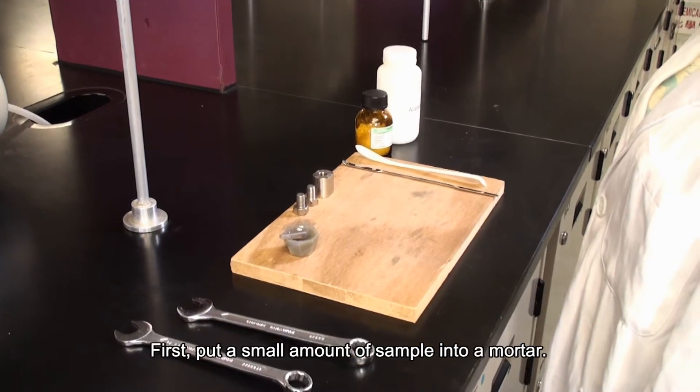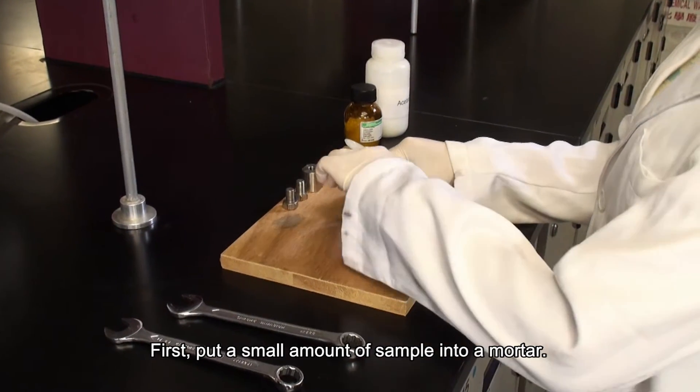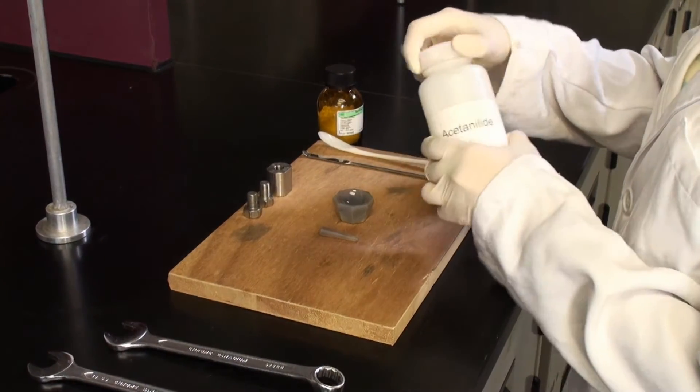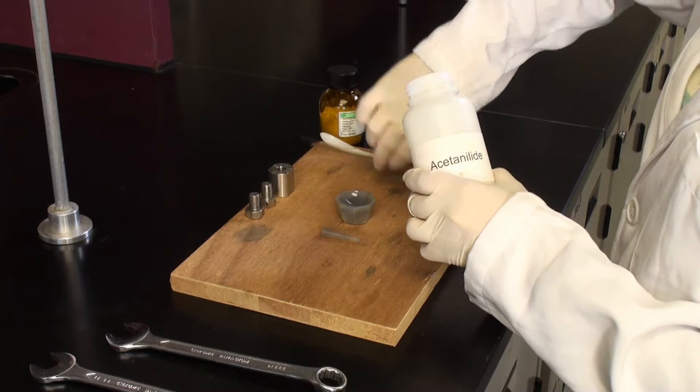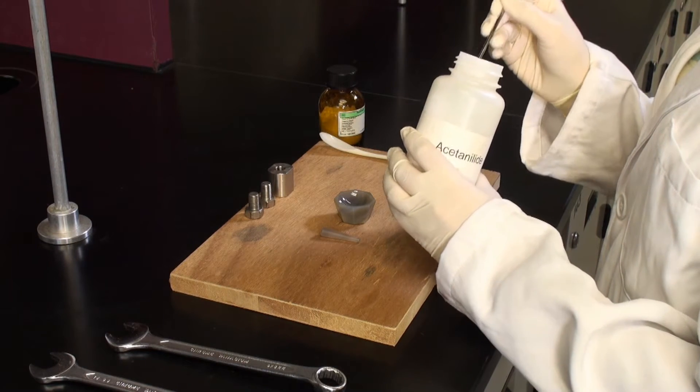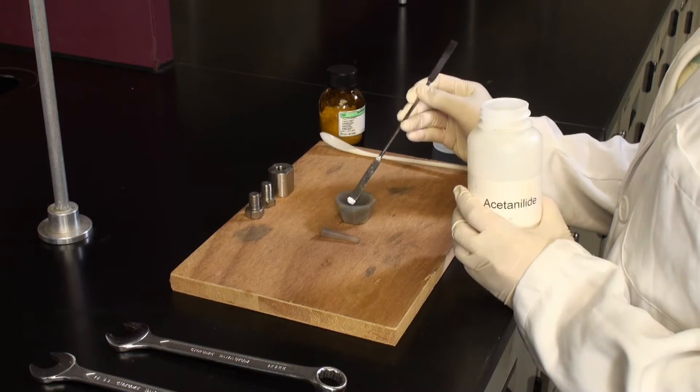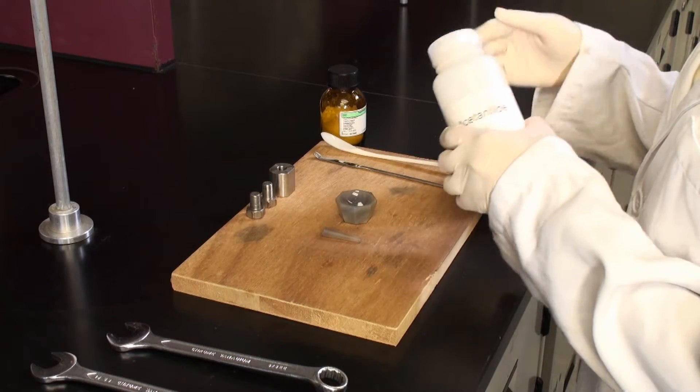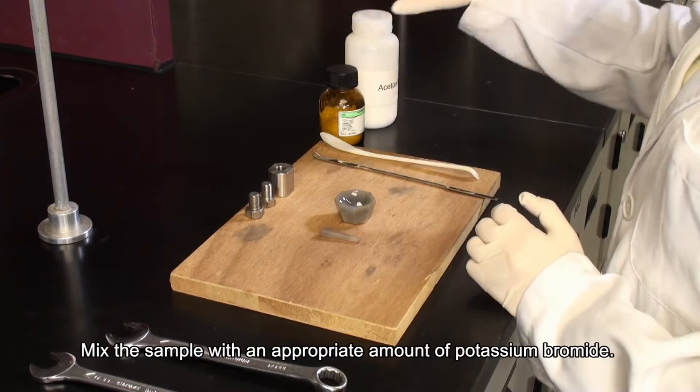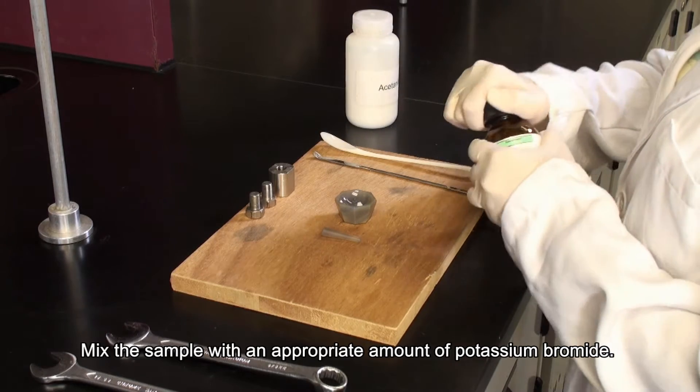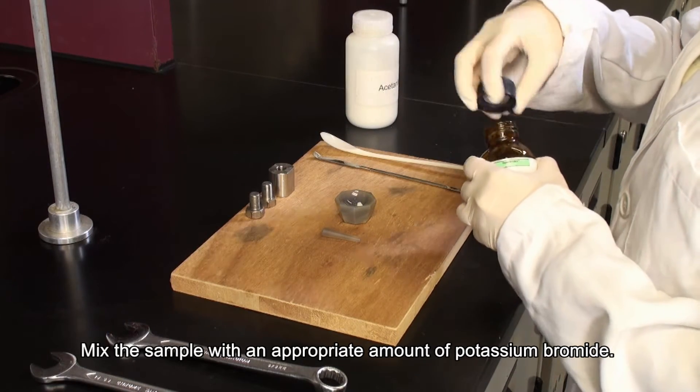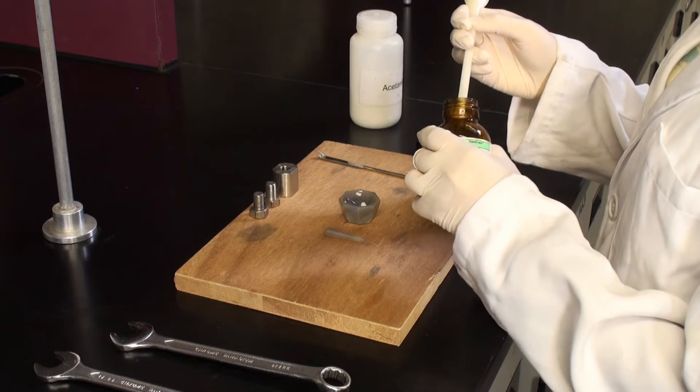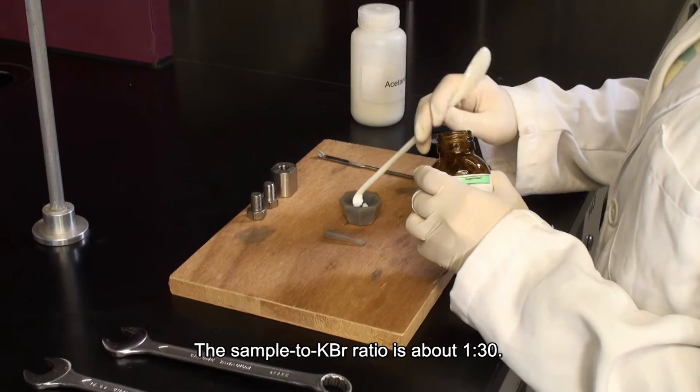First, put a small amount of sample into a mortar. Mix the sample with an appropriate amount of potassium bromide. The sample to KBr ratio is about 1 to 30.